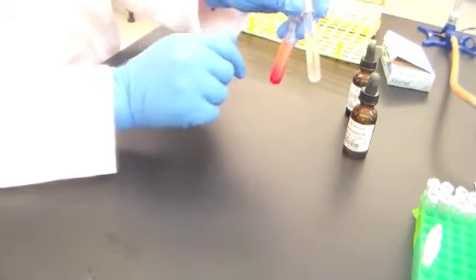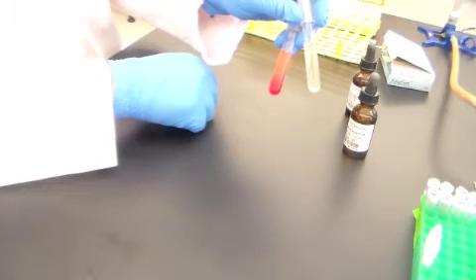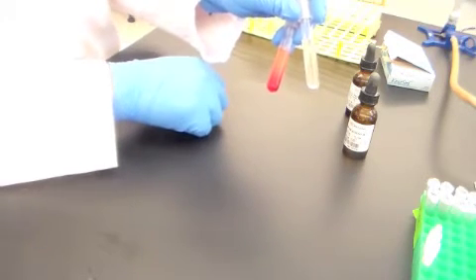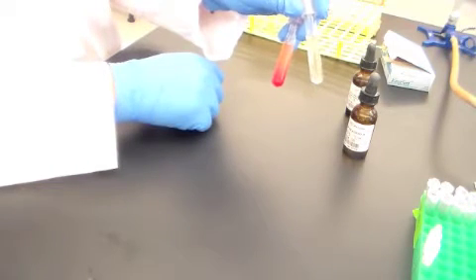So it reduced that nitrate to nitrite, but it took that nitrite no further. It could do nothing with that nitrite. So once this bacterium, this happens to be, well, I won't tell you. I'll let you be surprised by your bacteria.